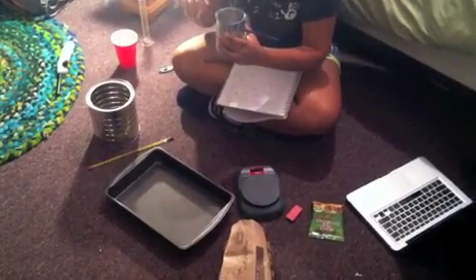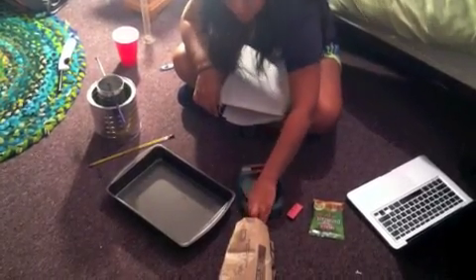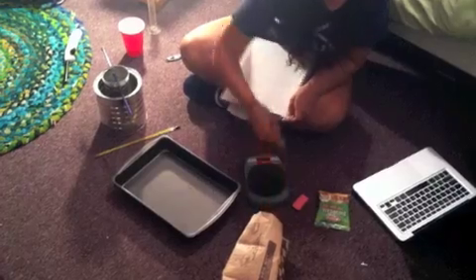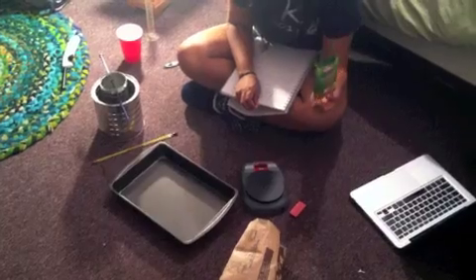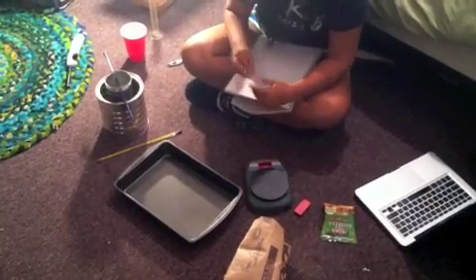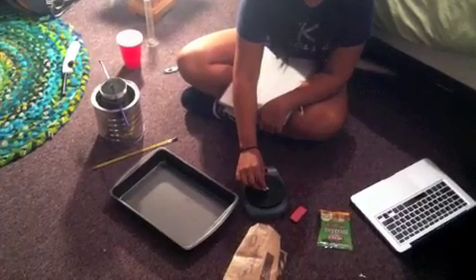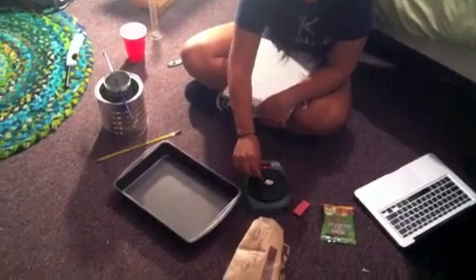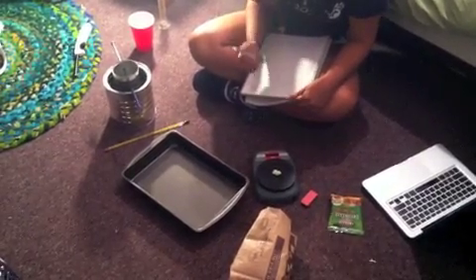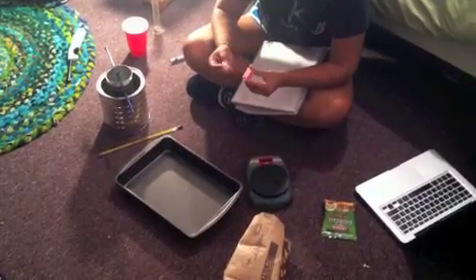We can put the rod through and suspend the inner can. We'll use popcorn as one of our first food items. Other things I plan on using are various nuts, and maybe items in categories like protein, fats, and carbs — maybe pieces of bread. I'm going to weigh the food item before putting it on the needle. It's barely a gram — it's 0.5 grams.